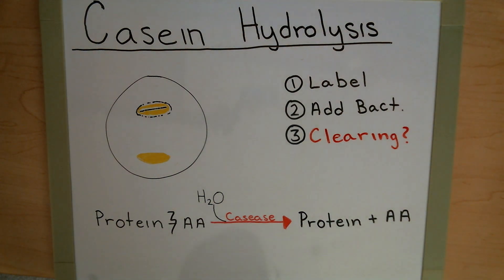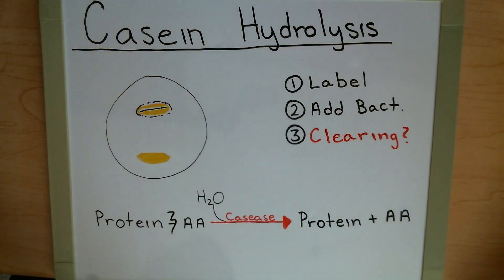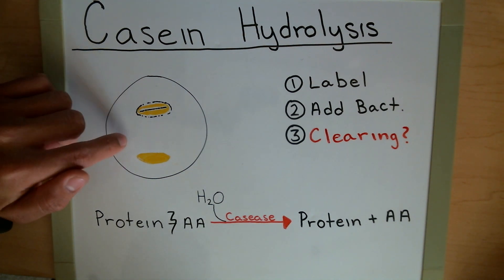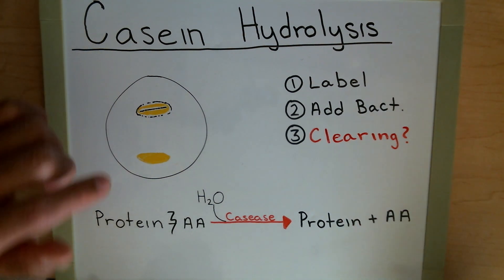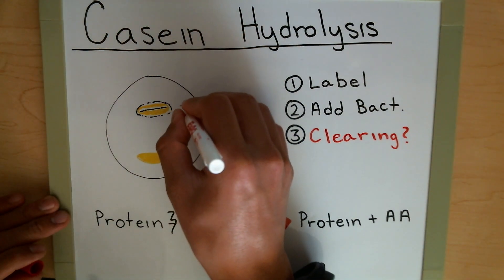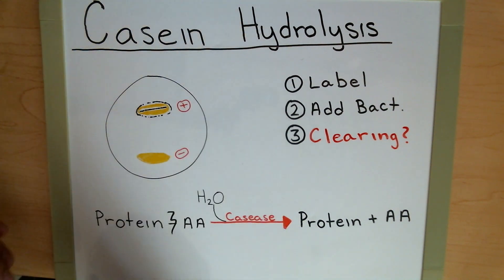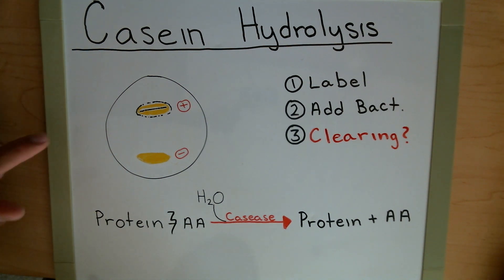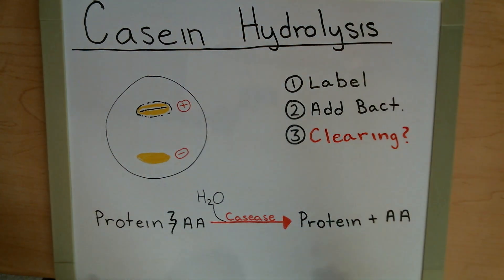When I did this lab, the bacteria with a clearing also appeared a little bit darker than the one with a negative result that does not have a clearing. So the top one is our positive result and the bottom one is our negative result. We're just looking for that clearing or a little haziness around the edge — something that gives it a little extra pop beyond just the growth of the bacteria itself.